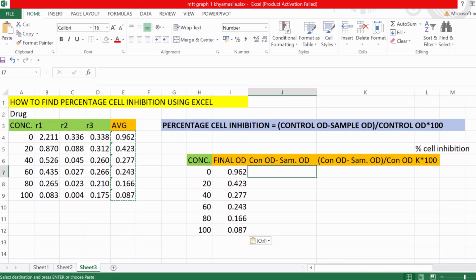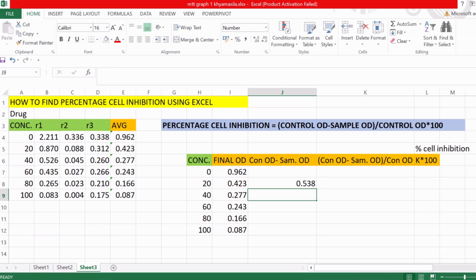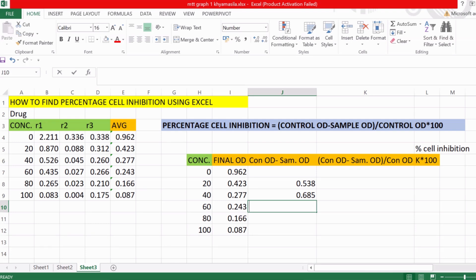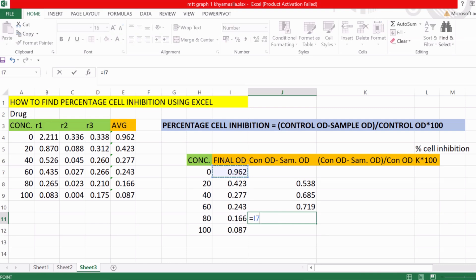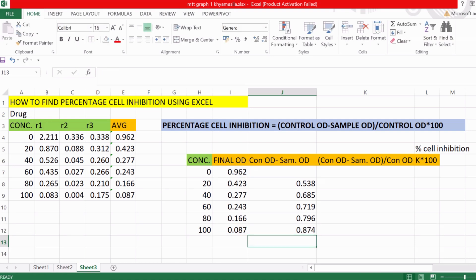To find ctrl OD minus sample OD, we start from concentration 20 since there is no need to calculate for the control value itself. Put an equal-to sign, select the ctrl OD cell, then subtract the sample OD for that concentration. We do this separately for all concentrations to get ctrl OD minus sample OD for each.